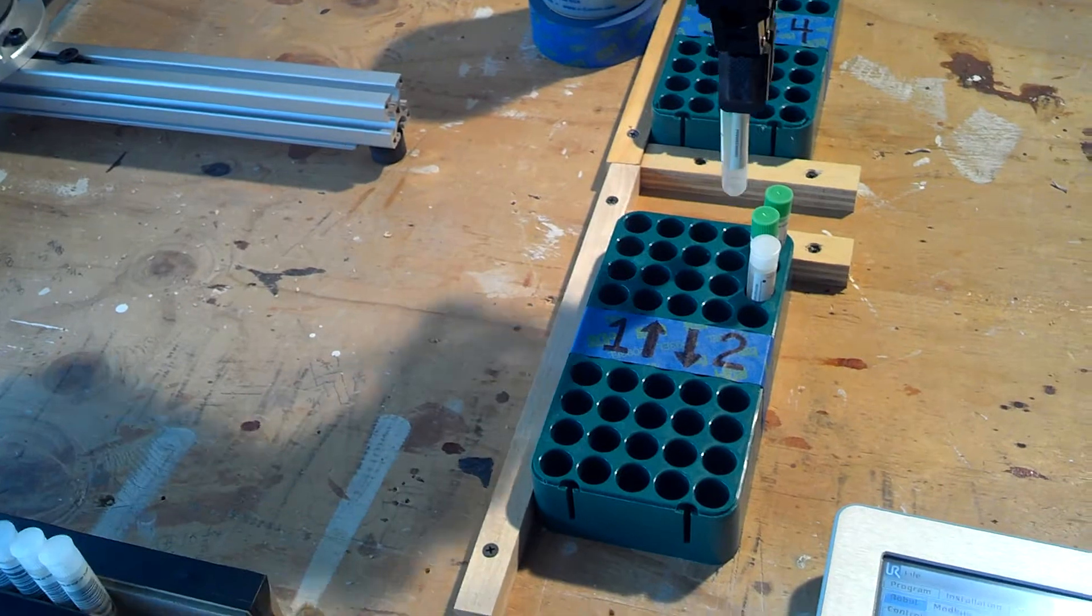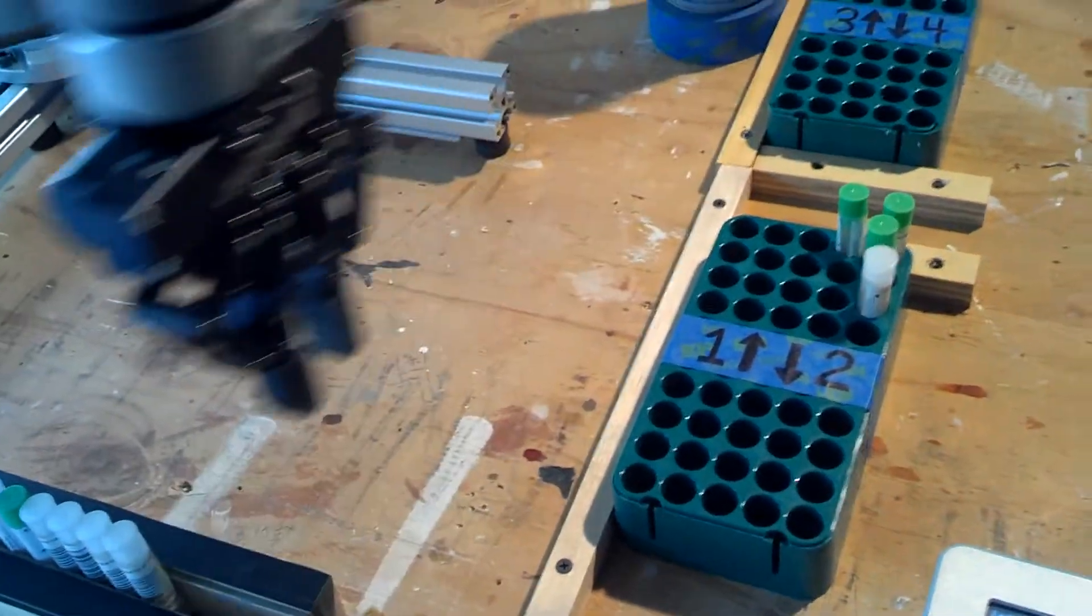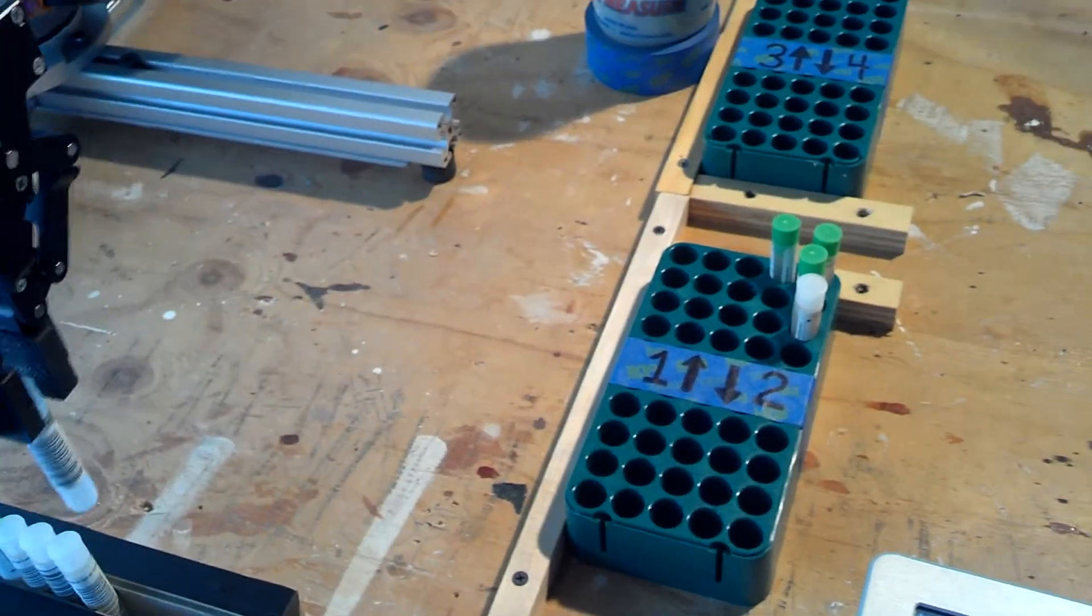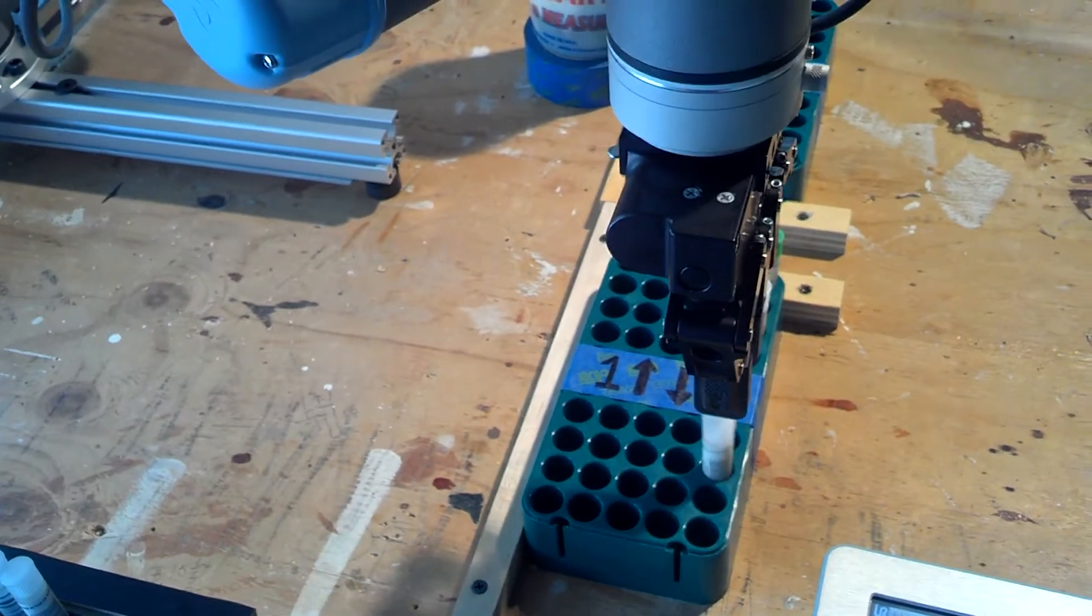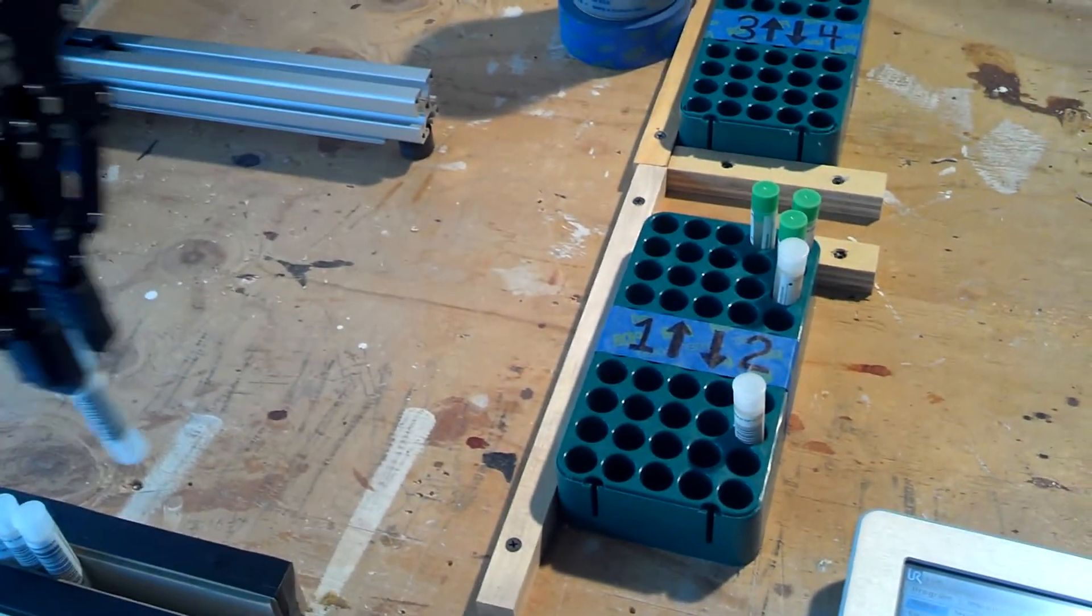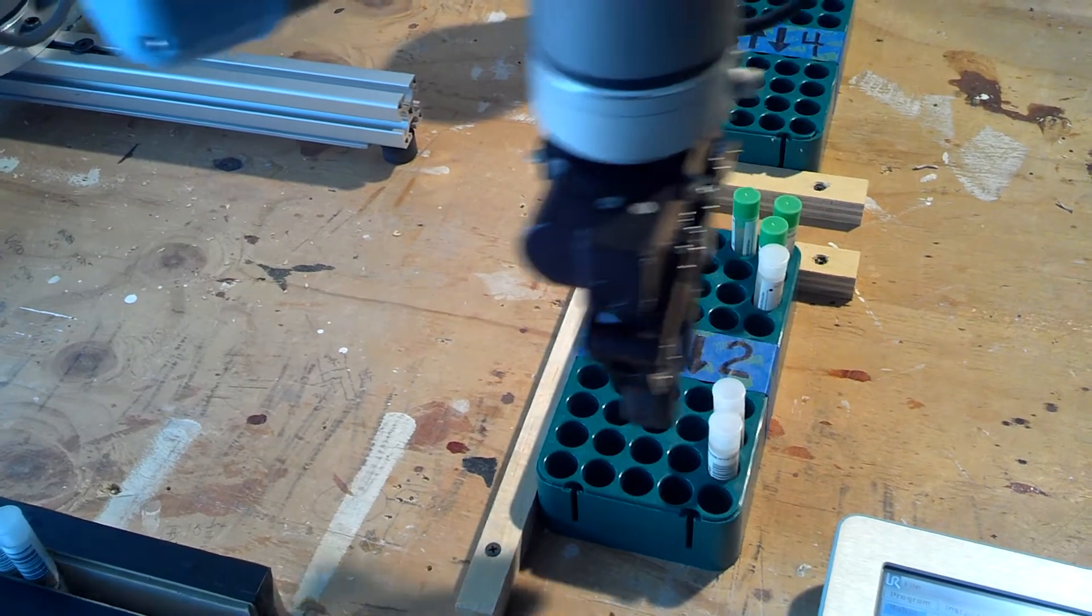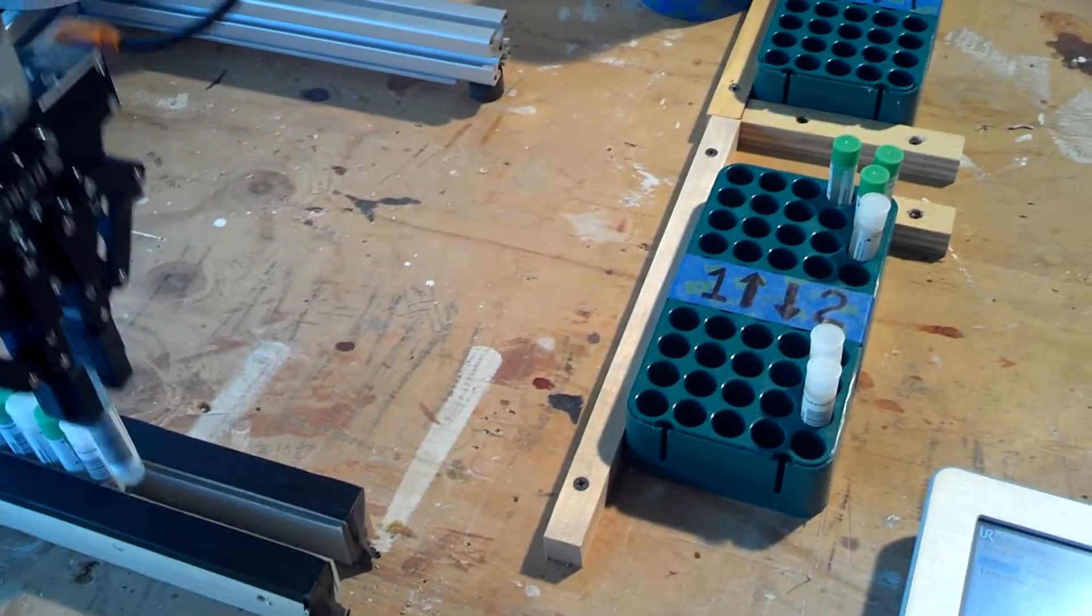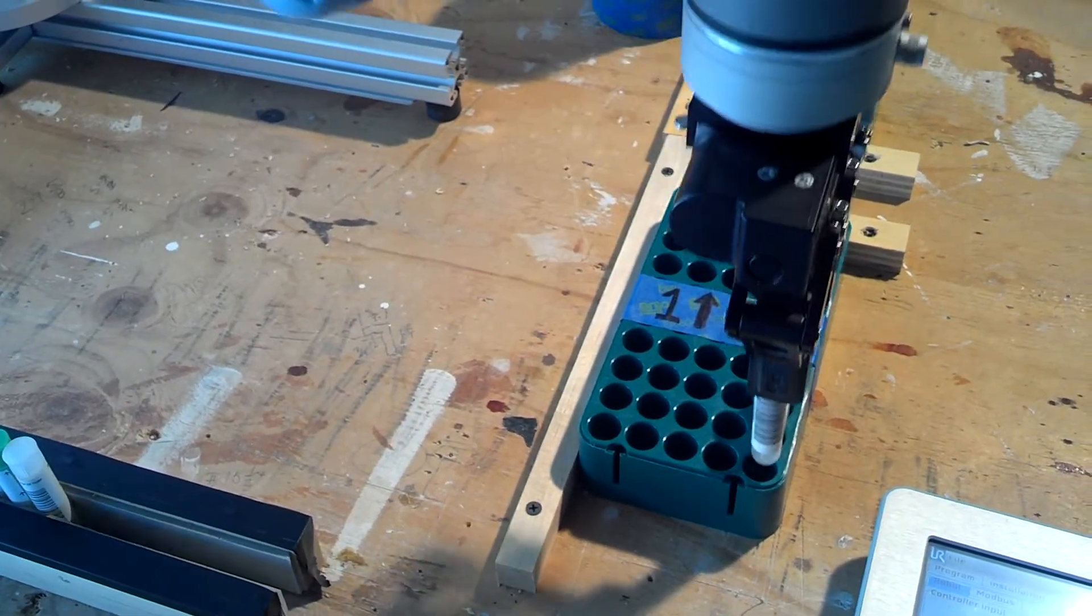Obviously, the picking and presentation of the test tubes is not ideal, not real precise in this setup, so it doesn't always set it in the right, perfectly right spot. It might miss a hole now and then, but it's doing a pretty good job.